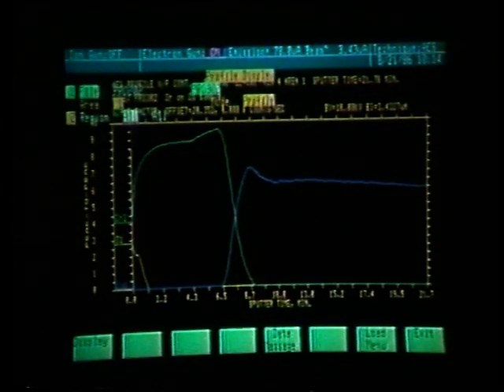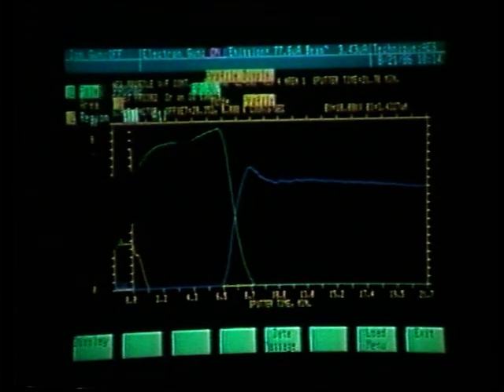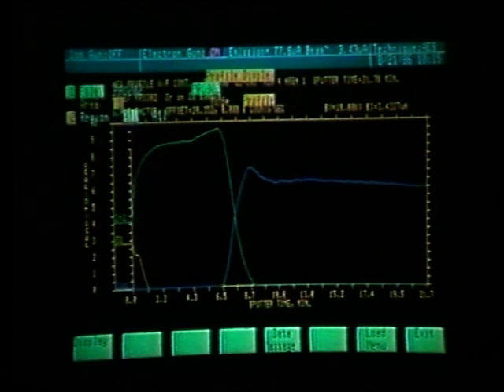What we would like to now demonstrate is the suspend acquisition mode of a profile. What we will do is we will find another area on the sample that has not been sputtered and set up for a window profile. What we would like to do is suspend the profile at this interface and take a full survey scan. That can be very helpful in determining whether at the interface we have contaminants that we were not following in the original profile.